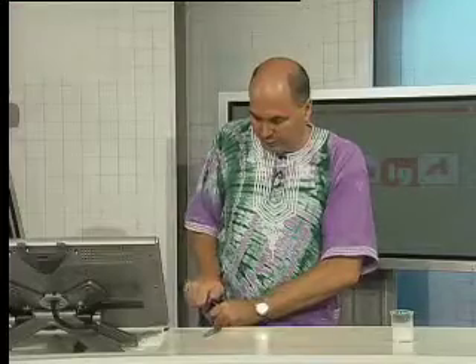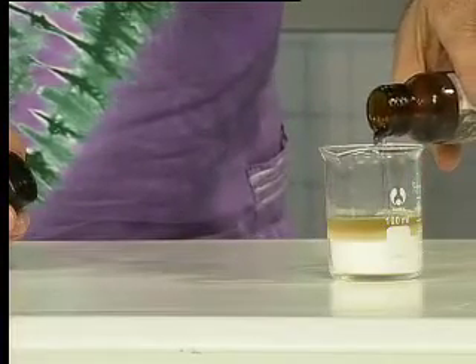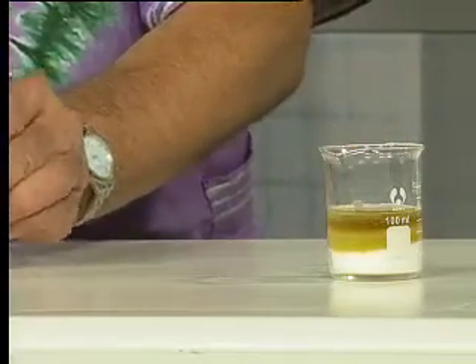I'm just going to open the seal — should have done that earlier — and I'm going to pour some sulfuric acid in there, quite a bit. Now watch carefully how the color begins to change.